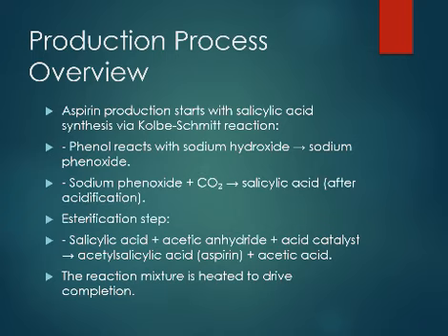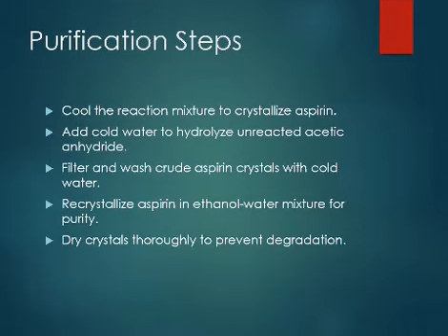For the esterification step, salicylic acid is treated with acetic anhydride and an acid catalyst to produce the aspirin, which is acetylsalicylic acid and acetic acid. The reaction mixture is heated to completion. For the purification step of aspirin, the reaction mixture is cooled to crystallize the aspirin.